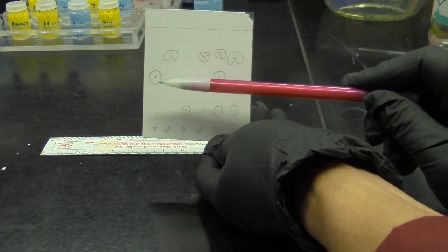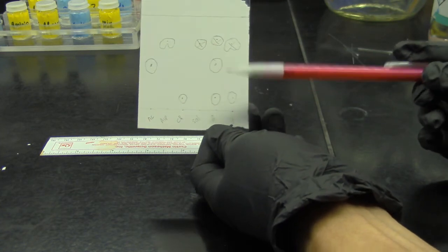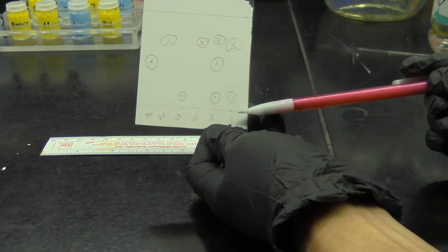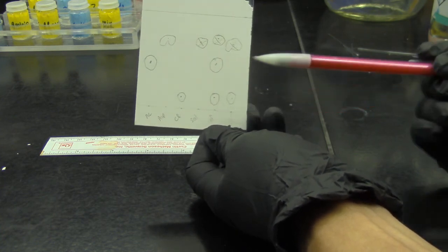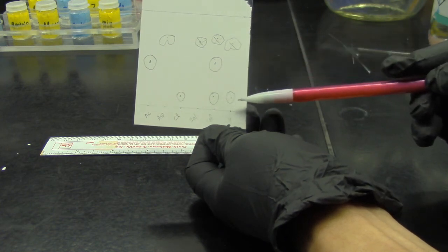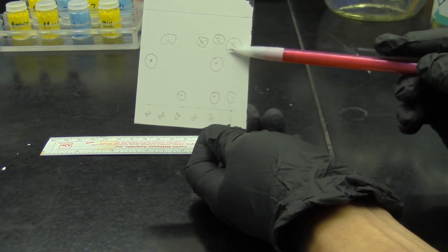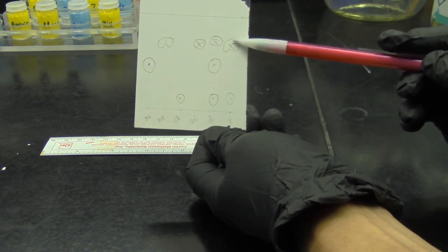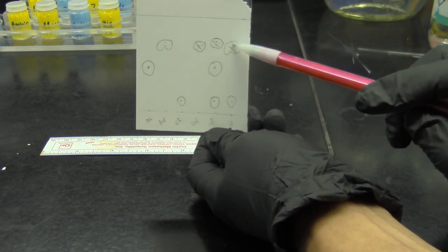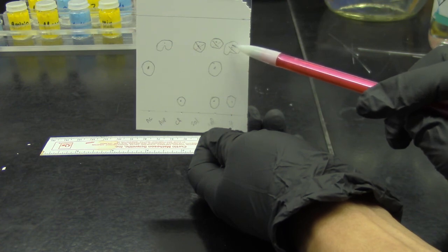Calculate all these RF values for each compound, and compare the RF values with the unknown analgesic number 4. Here in this example, I'm using number 4. Compare the RF values and also whether it's fluorescing under the long or short UV light. So you want to note whether I crossed it out under UV light, both long and short wavelength, right?